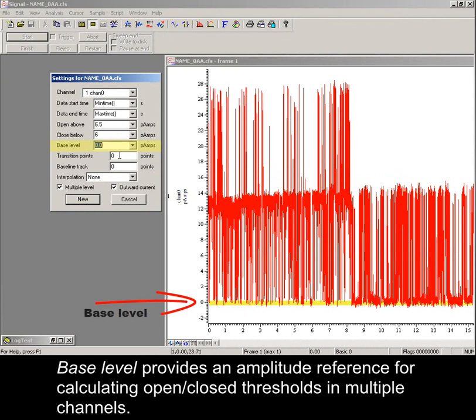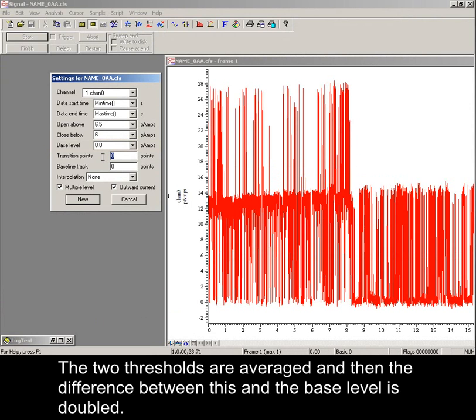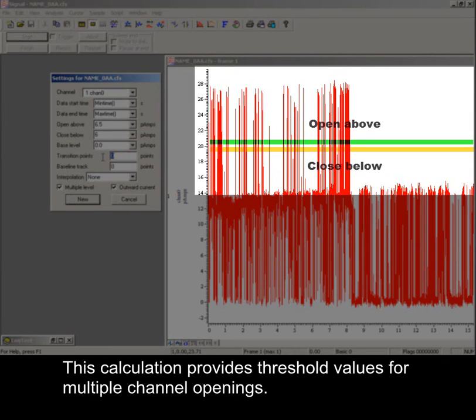Base level provides an amplitude reference for calculating open-closed thresholds in multiple channels. The two thresholds are averaged, and then the difference between this and the base level is doubled. This calculation provides threshold values for multiple channel openings.